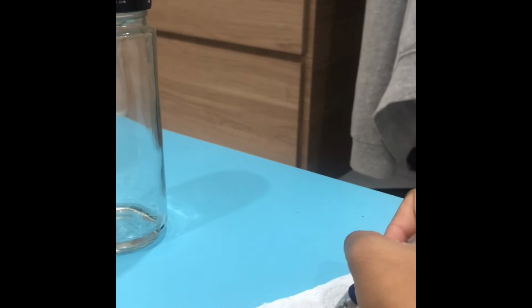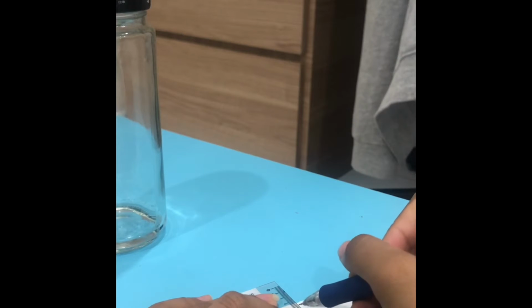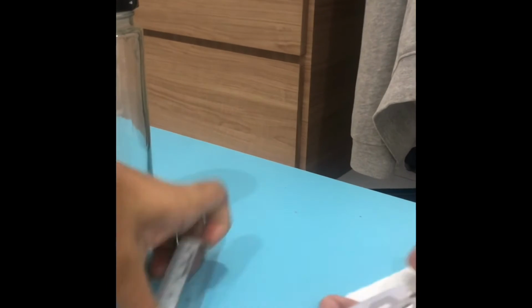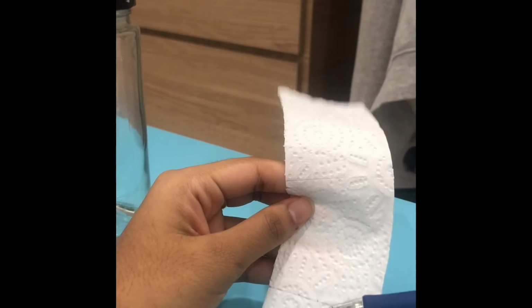I'll give it a bit more. I'll put it up 7. Okay, so I'll mark that. Okay, so I've drawn the lines now. It's very light. So right about now, I will be placing a small dot. Also using that, I'll be measuring to draw it right in the middle. Okay. So this is where I will be spotting the sample onto the TLC plate.